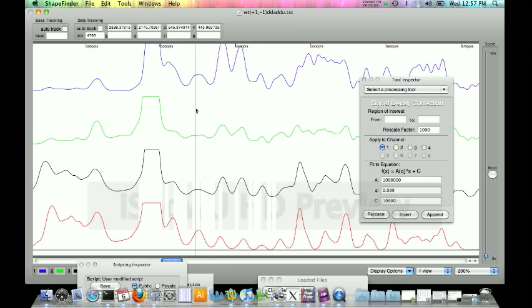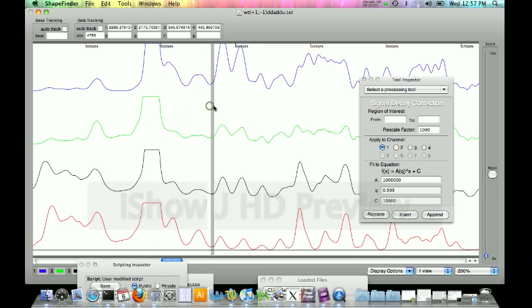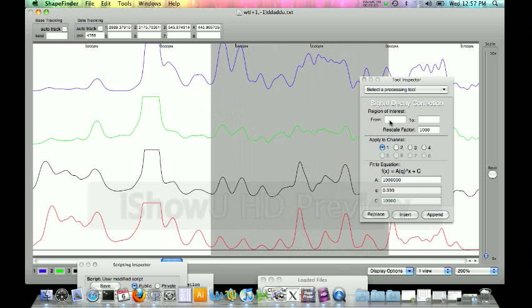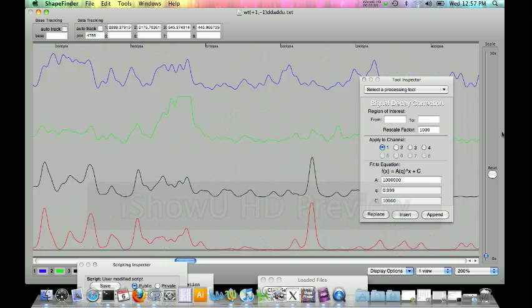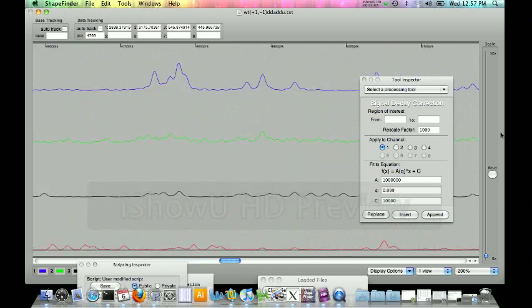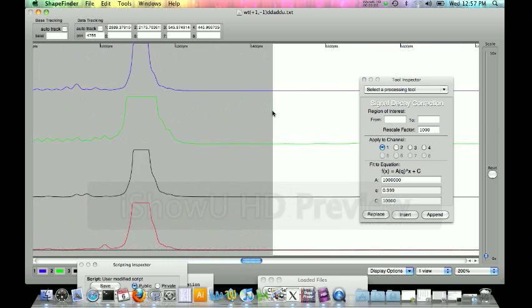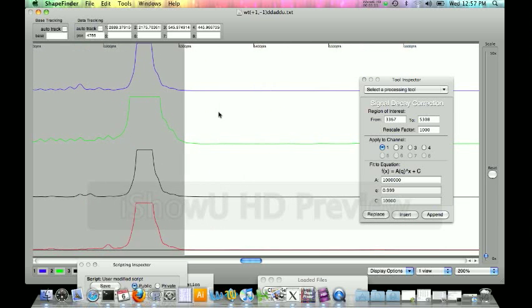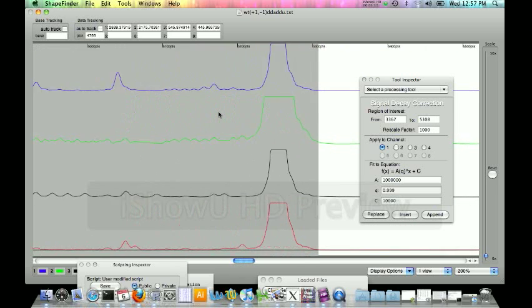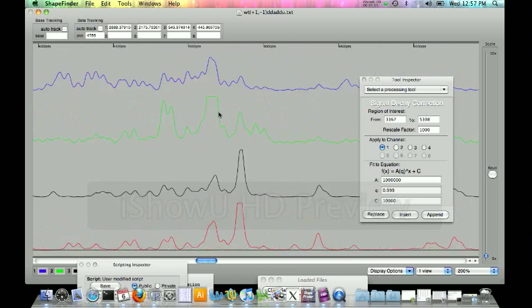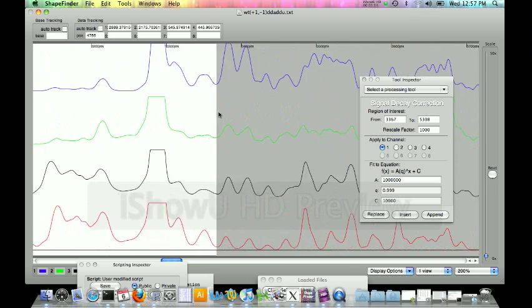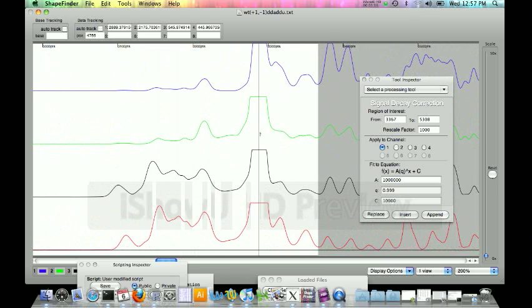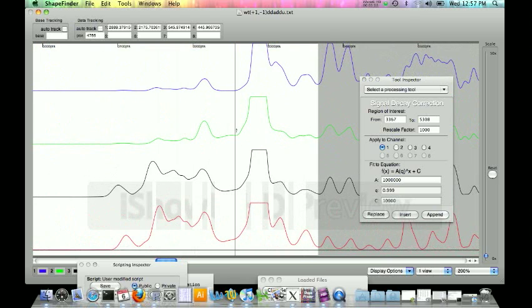Right here we have our RT peak and we're going to go ahead and just choose an area directly to the right of that and we're going to come up all the way to the right and just including our primer front. So here's our primer front, we're just going to go right on the right side of that. So this is our signal decay area. As you can see it's going to cut out a little bit of the data to the left of the RT peak which is perfectly fine.